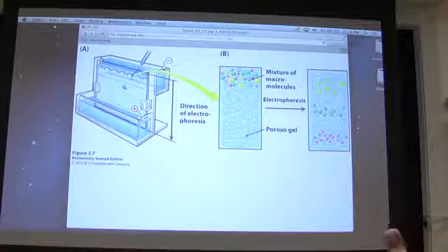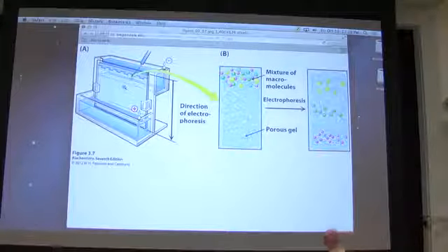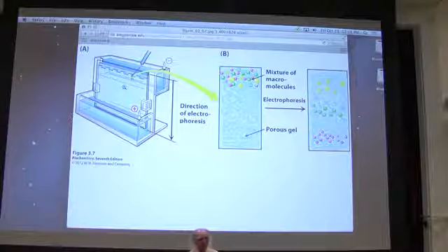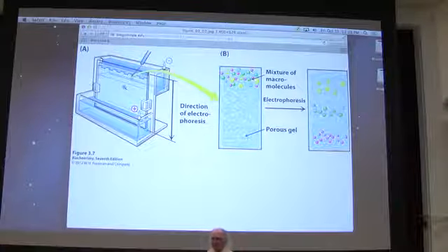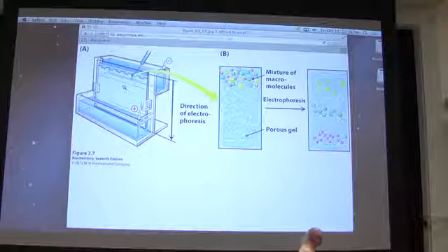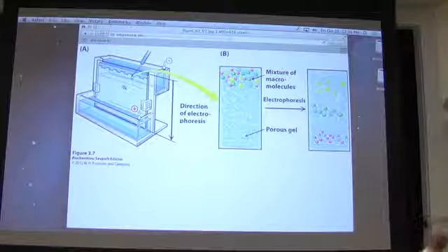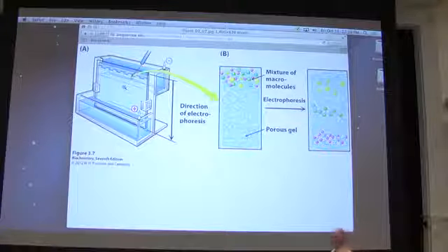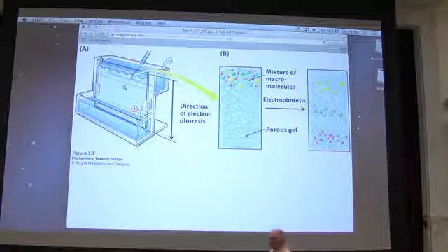And this technique is really powerful because I can separate something that has, let's say, 500 nucleotides from something that has 600 nucleotides reasonably well. Okay? I can do that separation. All right? And agarose gel electrophoresis allows me to do that. Well, if you understand agarose gel electrophoresis, you're going to understand polyacrylamide gel electrophoresis as well. There's only a couple of considerations for that.